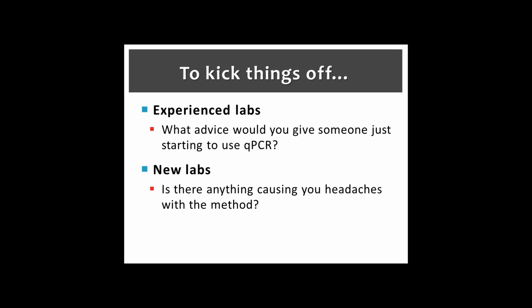I'm Holly Center, and I'm the representative for Life Technologies, where the StepOne Plus came from. I do have one downstairs. I brought a computer with software, but I'll bet most people didn't bring data files other than Excel spreadsheets, which I can look at, and I can give you some general guidelines, but I can't translate them into standard curves for you. One of the things I'm going to offer to everyone here, I know that I've worked with almost every lab to get everybody set up, and we've gone through some trainings, and before you actually do the work, it's great to look at that, but it doesn't stick until after you start doing stuff, and I totally understand that.